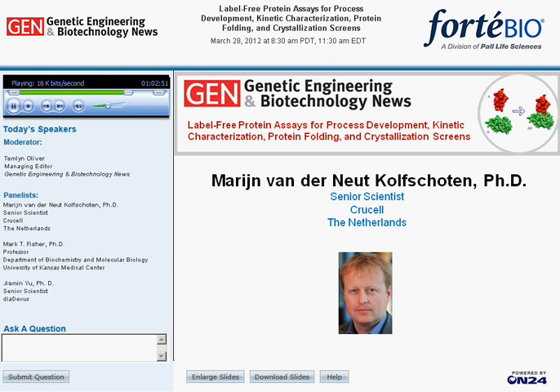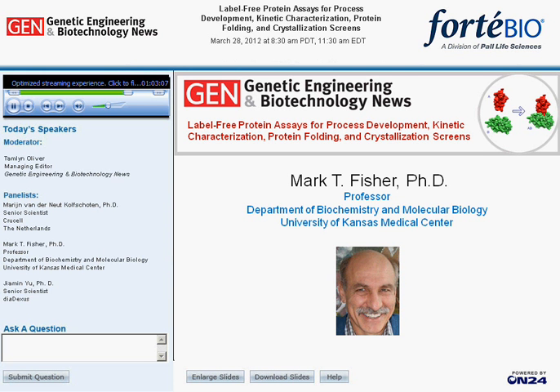Okay, Mark, I have some questions for you now. The first one is, wouldn't the immobilization of the protein of interest onto the optical sensor probe change the native conformation of the protein, i.e. in solution versus immobilized? If you look at the particular slide presentation here, one of the things that we had done to avoid that particular problem is that we don't attach the proteins directly onto the tip surface. In most cases, we have the protein attached through a chimeric construct.